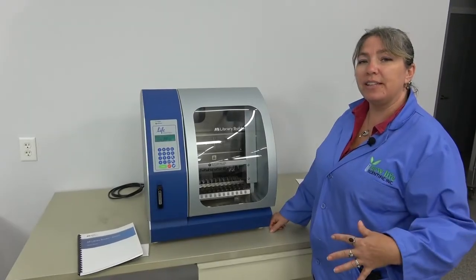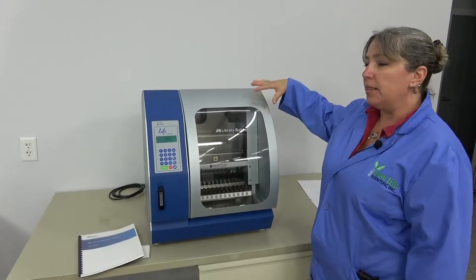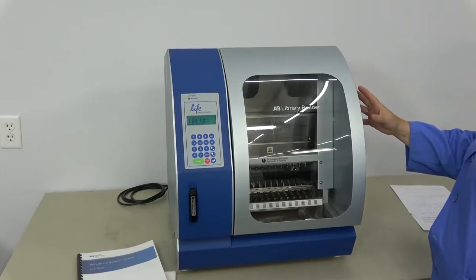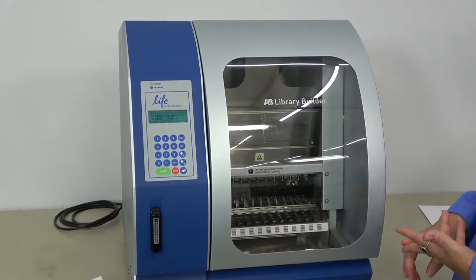Hi, I'm Lori and I'm at New Life Scientific today taking a look at the AB Library Builder by Life Technologies. This benchtop instrument simplifies the creation of DNA and RNA libraries including exome, whole transcriptome, and targeted resequencing.